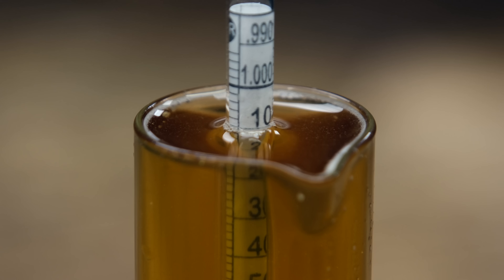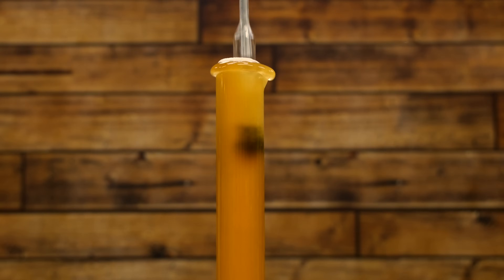You can use it on any liquid throughout the brewing process to get a gravity reading — it doesn't just need to be pre-fermentation, you can actually take gravity readings all the way through the process. Even on the finished beer, as long as you de-gas it, you can get a reading from it. The big benefit here is that you are getting lab-accurate results of your gravity readings. And unlike a glass hydrometer, you haven't got the hassle of trying to read the meniscus or avoid the bubbles, taking a big sample of 100, 200, maybe 250 mils. This is just 10 mils — it's a really good way to cut down the amount of beer you're sampling throughout the brewing process.